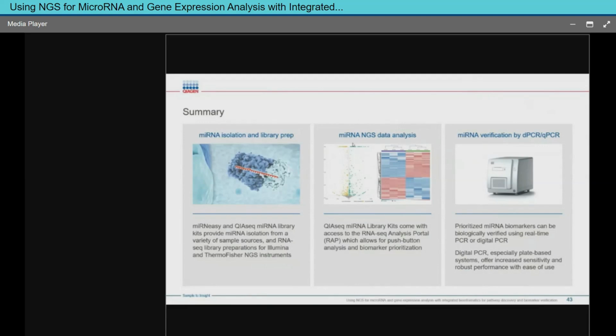After those 6 samples, we moved up to 24, and then we moved up to doing a couple hundred. Each time I got new samples, I compared those with the old samples. So my first data set was 6. My next data set was 30. After that, my next data set was 360 samples. Each time I kept growing my data set, I was able to go through and compare it with my old data and redo my analysis.